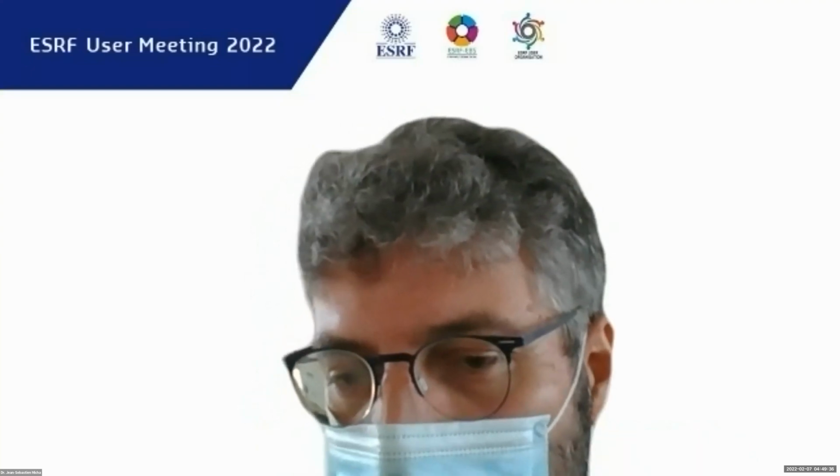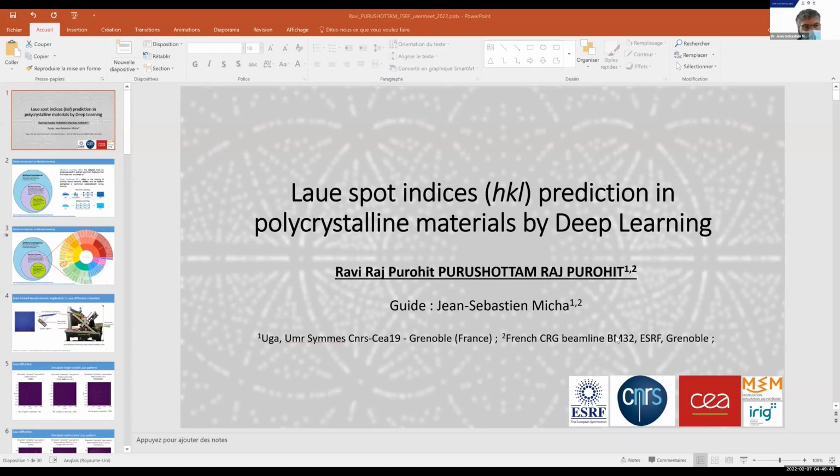For instance, what I've shown for the UO2 Laue pattern, we had several Laue patterns from UO2, but a single Laue pattern of UO2 is made of maybe, I don't remember, 200 spots maybe.